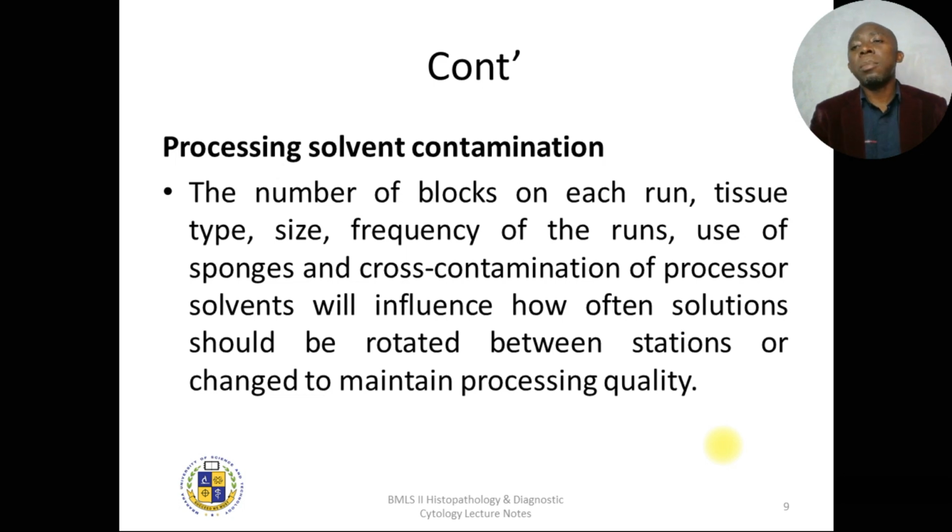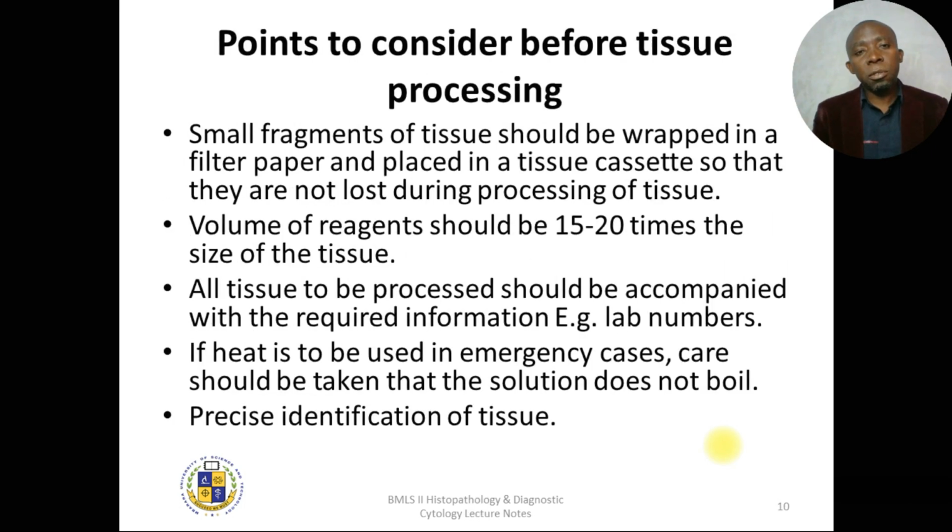These are policies which should be set up in the lab, that after a particular period of time we need to change the processing solvent, depending on the size, the type, and the number of runs that we have carried out. So before we go on, we need to put some consideration.